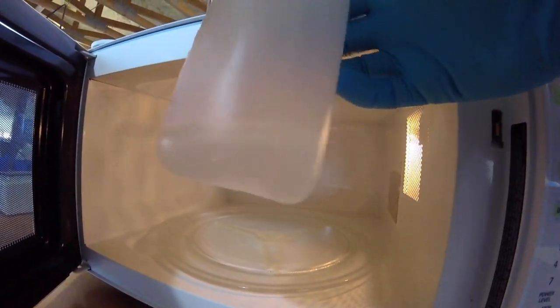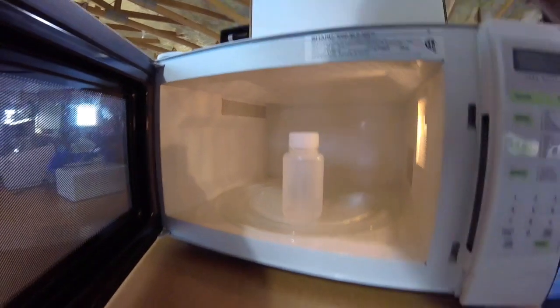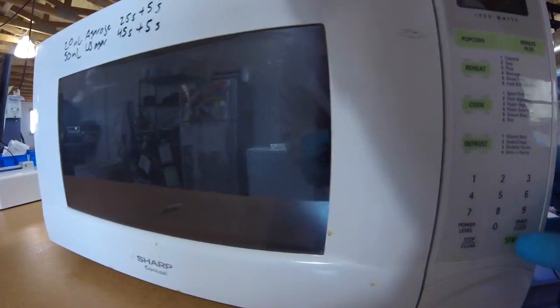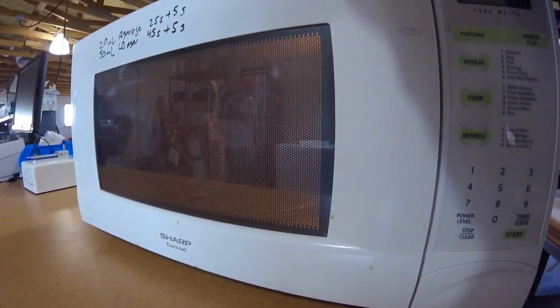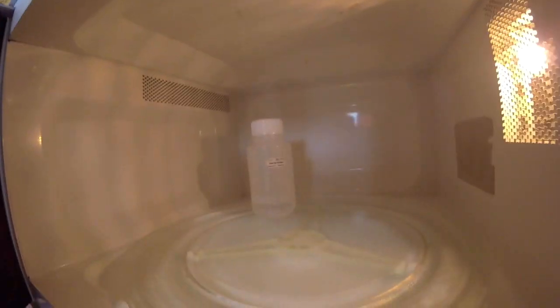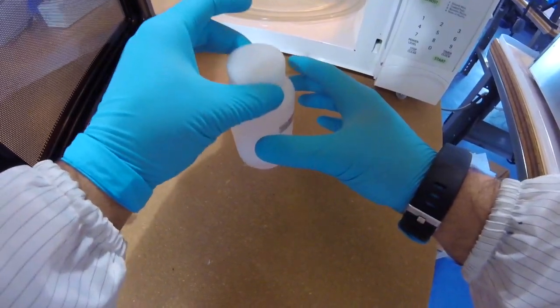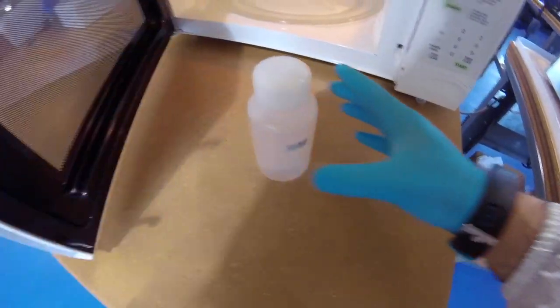All right, so you can definitely see there was a rolling boil there. Let me do one more 4 seconds just so you can make sure you can see a rolling boil. All right, so you can see the rolling boil there. Okay, so that's where you want it to be. Careful, it's going to be hot. If you hold it by the lid, it's going to be much less hot.